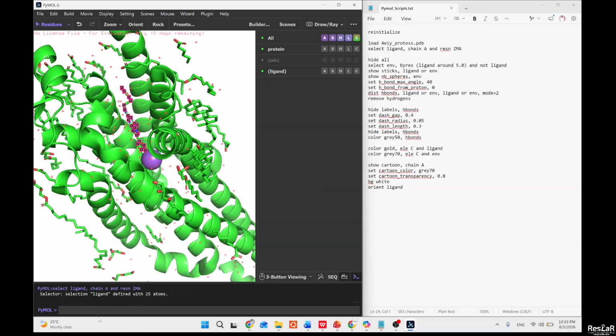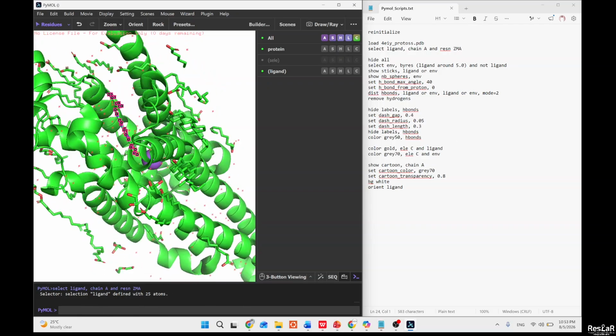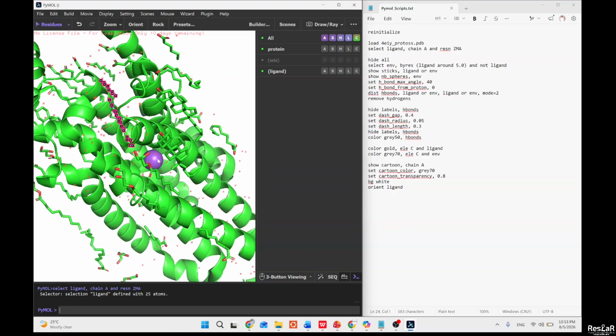Let us also define one other selection. It's not in my code, but let's define the zinc selection too. I think there is a zinc ion here. No, it's actually a sodium. So let's select ion as chain A and residue name sodium. So that is the ion.